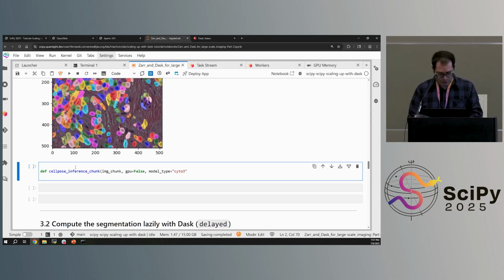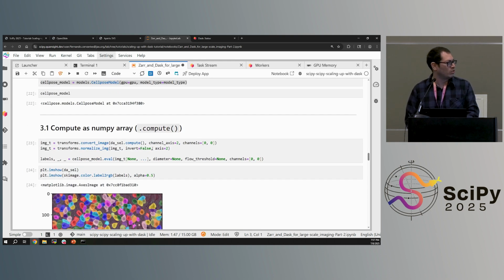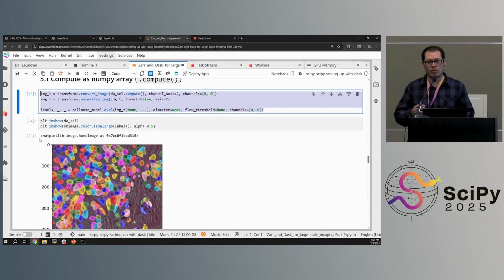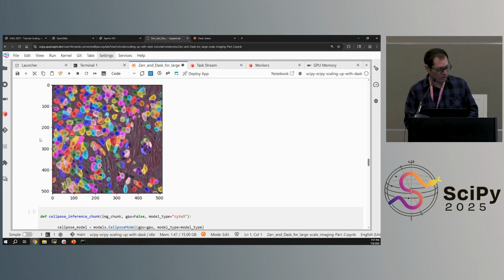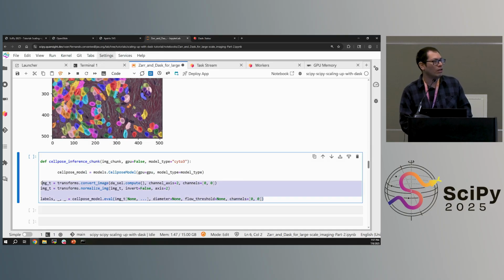Chunk. So 3, and probably preserving the size of this. Probably we could go lower. For those that are not using a GPU, it's not going to take that much time to analyze the image, because this is going to be the scale of the image that we're going to pass to the GPU to perform the inference. So depending on the capabilities that you have, you can increase the size of this. Of course, this is going to go through your GPU.